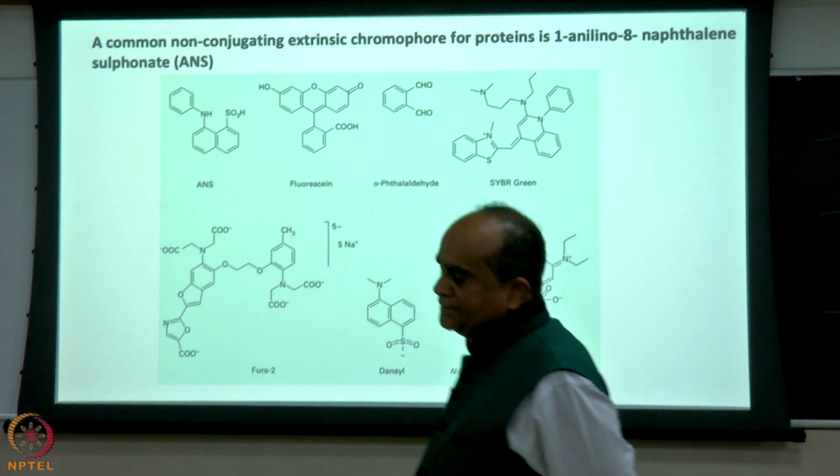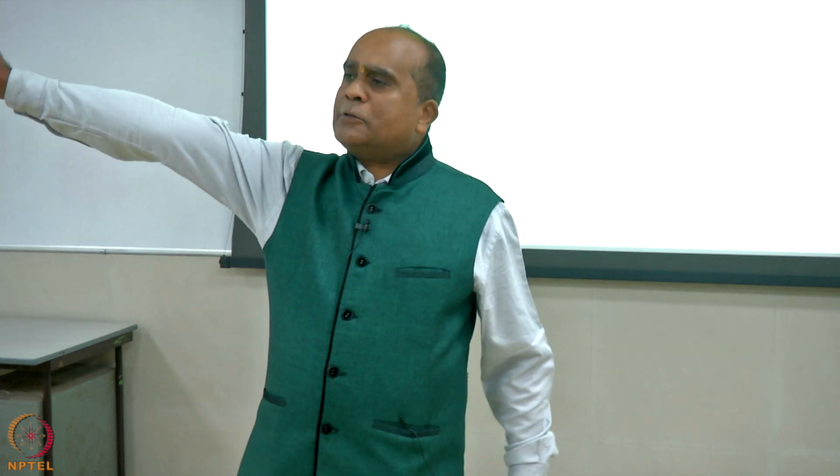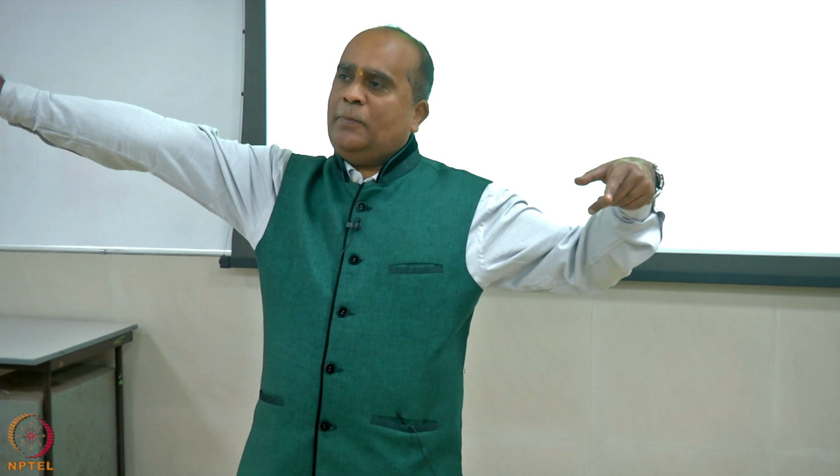Our issue is that in protein we have only one good intrinsic fluorophore if there is no cofactor, only one good fluorophore, which is tryptophan. Suppose I want to understand, which I am going to talk about, how this portion of a protein is talking to this portion of a protein.